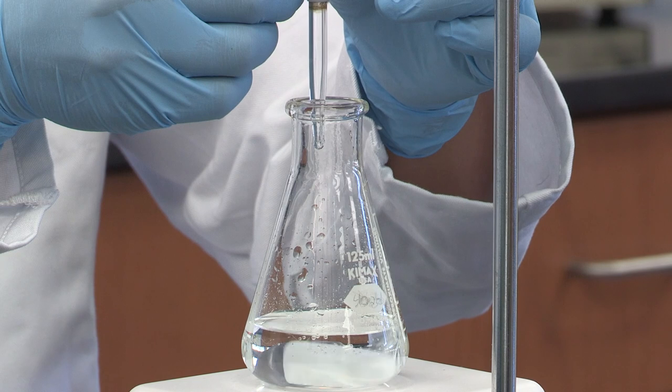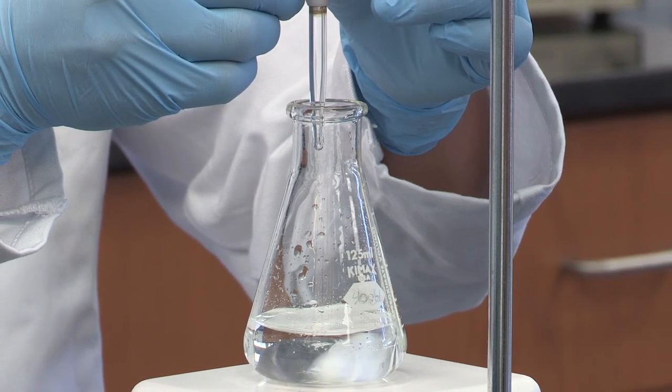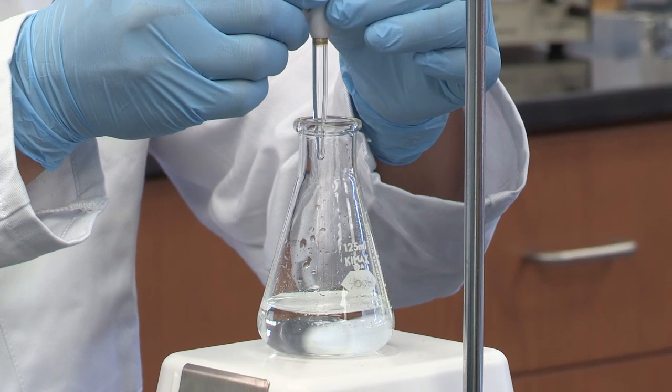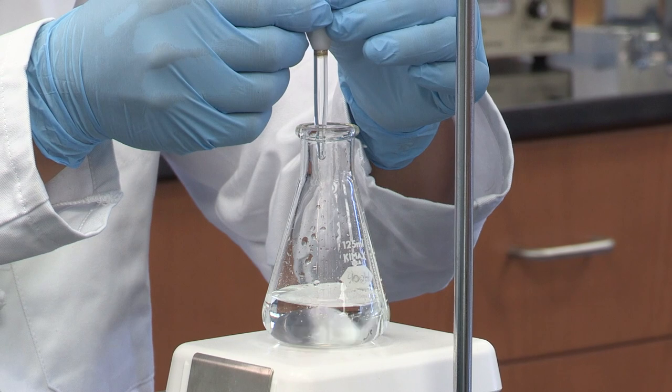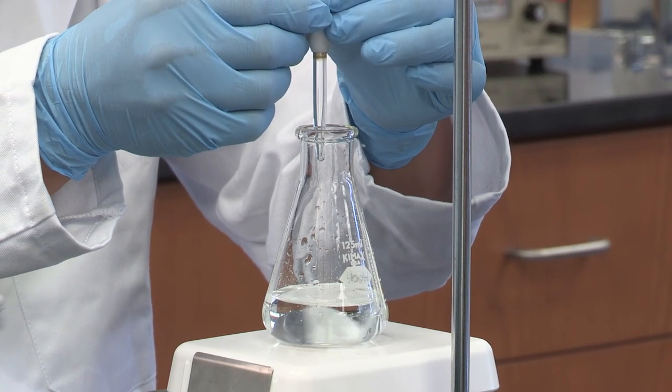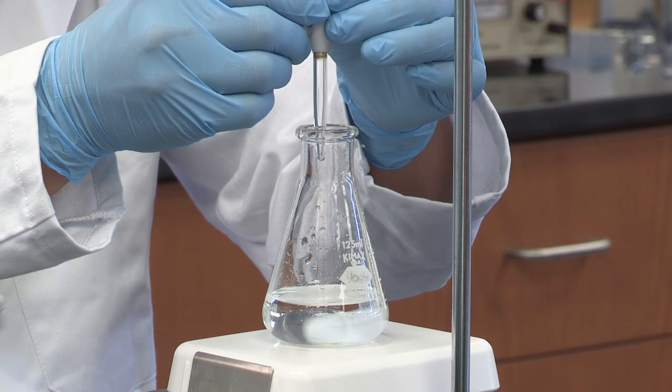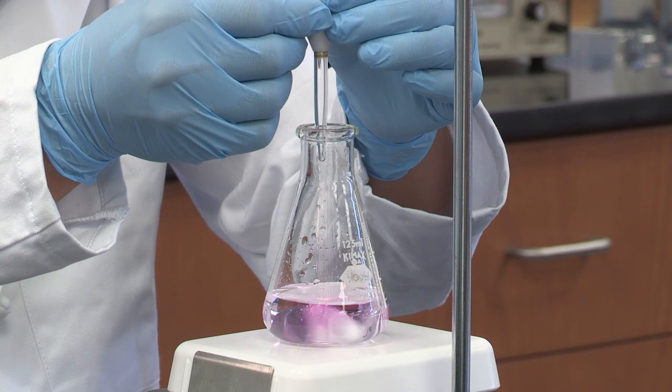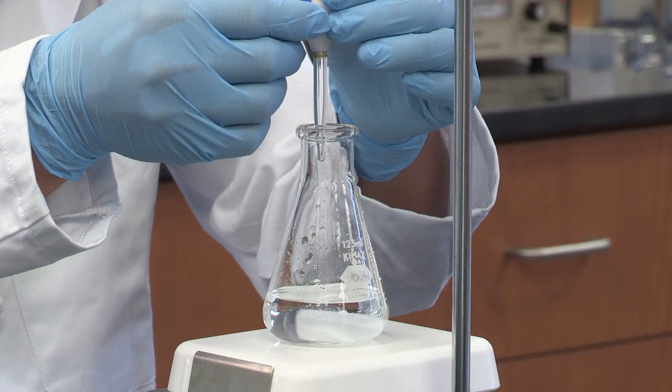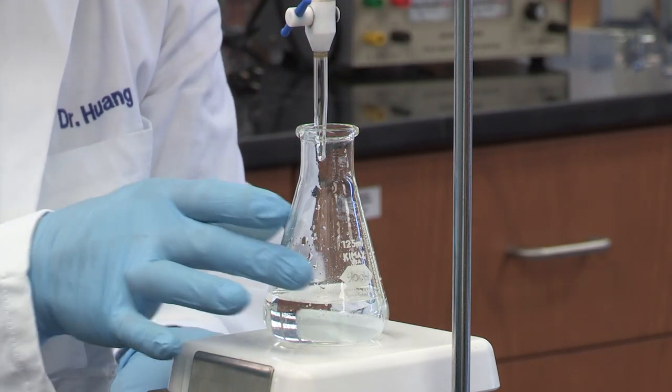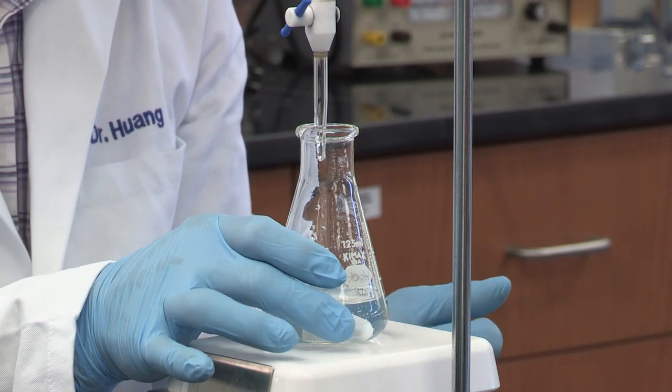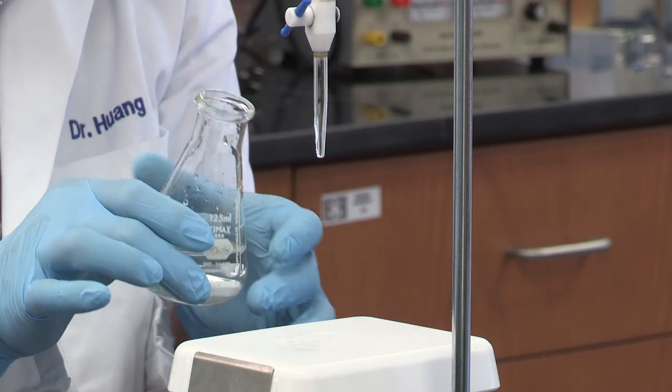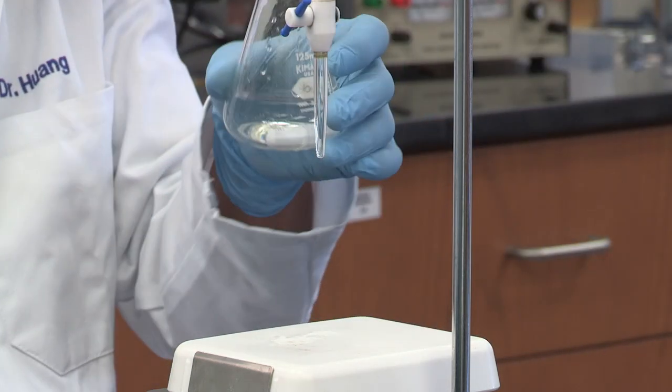Right now, you can see the color stays much longer. Now, we need to add drop by drop. This is the most important part. If you screw this up, you have to start over. Right now, you can see it stays really long. So, what I'm going to do is, I'm going to take this out. Let me turn off the stirrer first. And then, make sure if there is a tiny drop here, I'm going to let it touch. And then, I'm going to use my wash bottle to rinse this down.